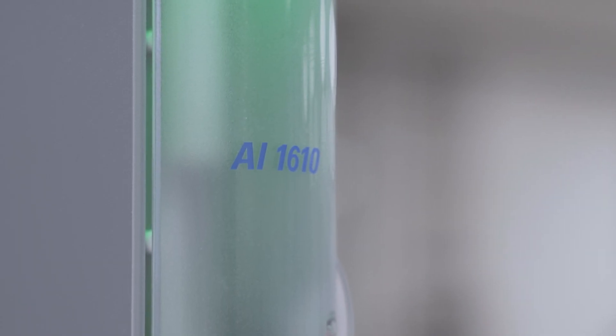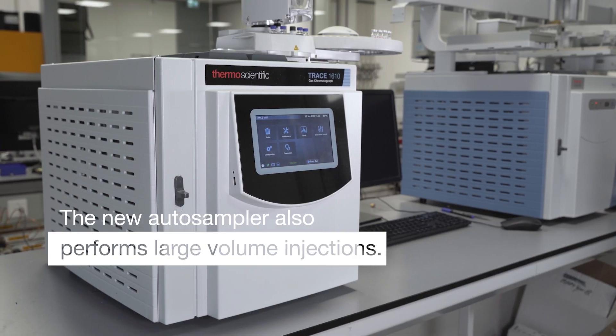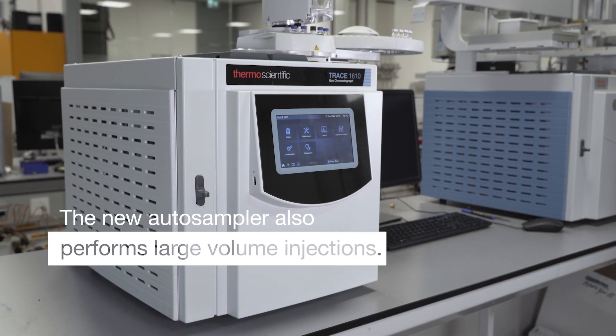If you need an auto sampler that just does liquid injections and no automated sample prep, then this is your auto sampler of choice. One other thing I also like about it is that it can now do large volume injections, which just makes the amount of applications you can run with it so much bigger.